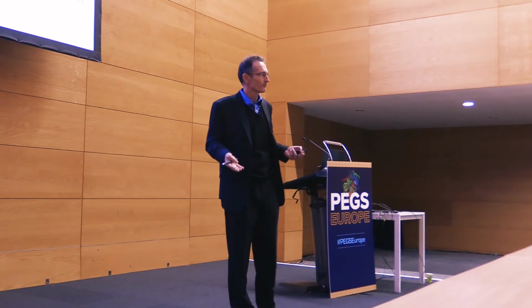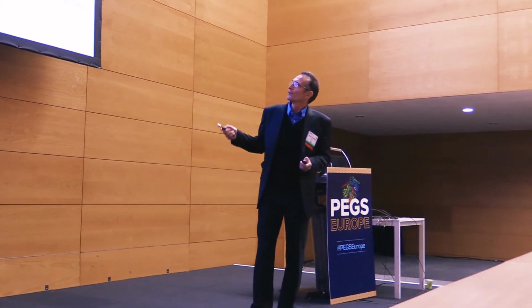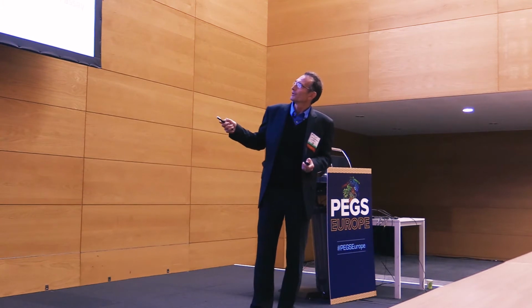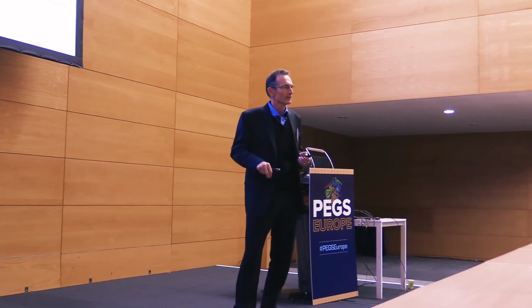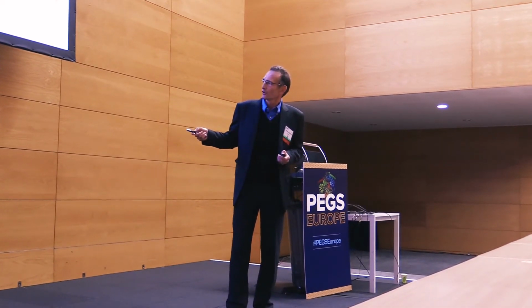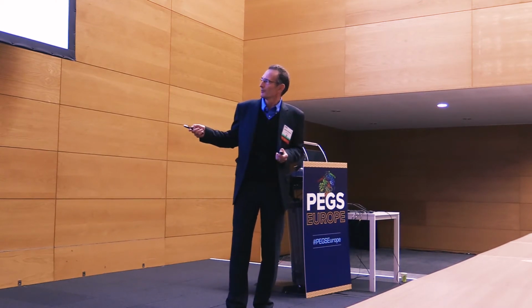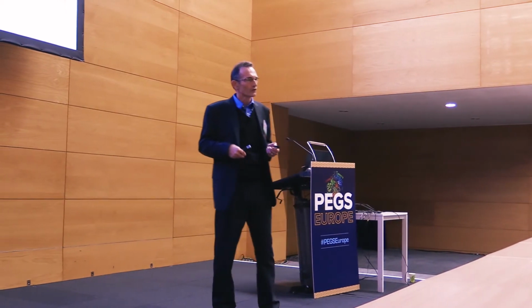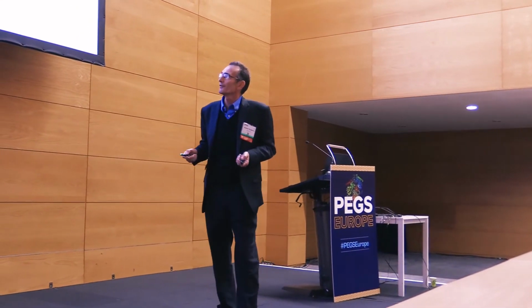So they're good antibodies. And what we chose was these 5 at the top that have no liabilities, no red flags. And then we also chose this one down here. I'll talk about this later. This is sirukumab. When we assessed developability, we needed a control to assess what a bad antibody looks like. So these are the 5 antibodies.